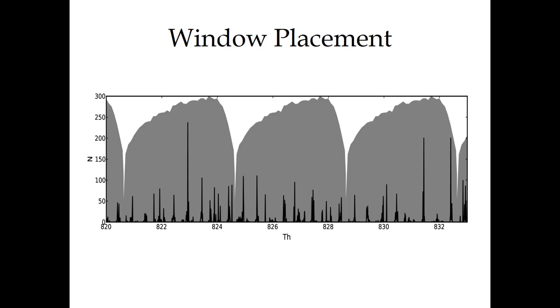Here's an example, actually, of what it would look like. Before I was showing you guys the QE Plus isolation, this is showing where the isolation windows would be if you're using 4 m/z windows and it's overlaid onto an MS spectrum. So you can kind of see that you still certainly have things near the edge of the windows. So it's not a perfect solution.